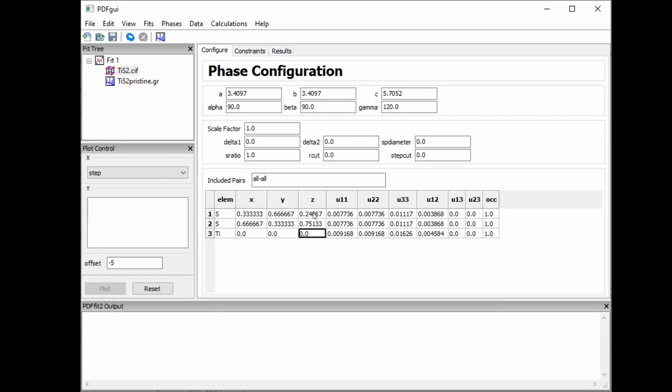And in terms of atomic positions, this is also very simple. So you see, this is a unique number. This is basically 1/3. This is 2/3. And this is some number very close to 0.25, right? But it's not exactly 0.25. And this number needs to be determined in order to really finalize the whole structure. So there's only one degree of freedom in atomic position, which is this Z value of the sulfur.